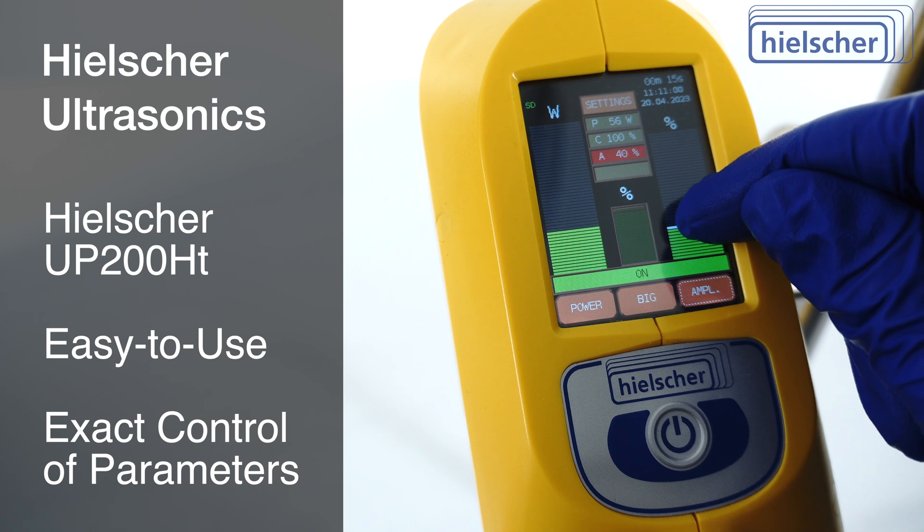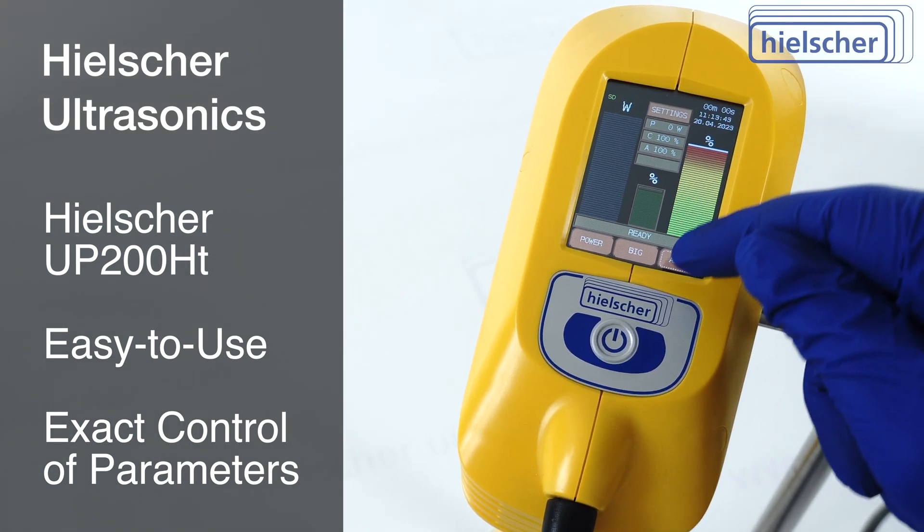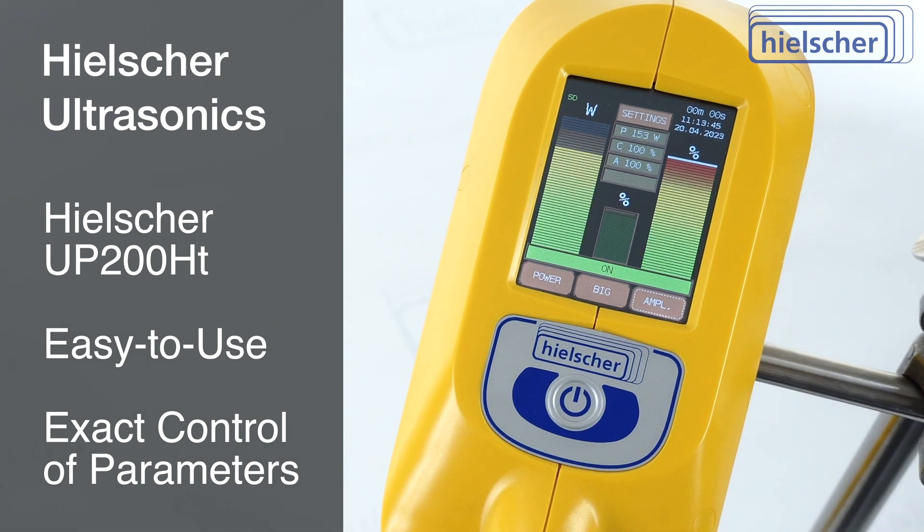You can easily adjust the sonication amplitude on the touch screen. We set the amplitude to 100% and start sonication.